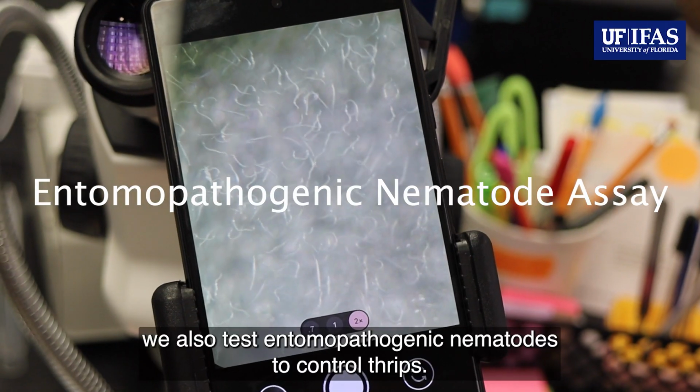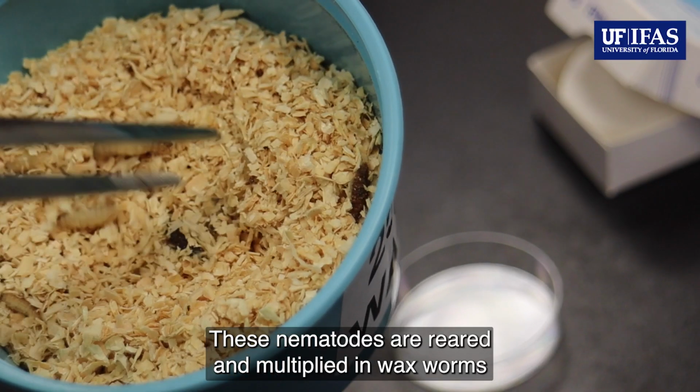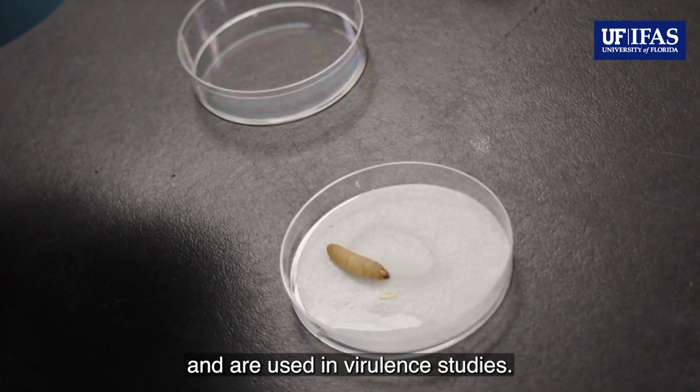In our lab, we also test entomopathogenic nematodes to control thrips. These nematodes are reared and multiplied in waxworms and are used in virulence studies.